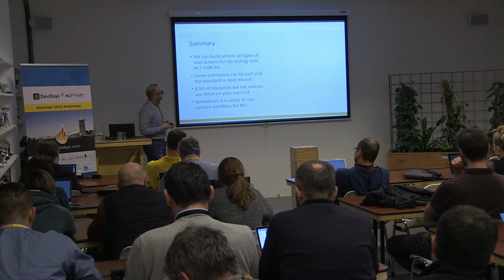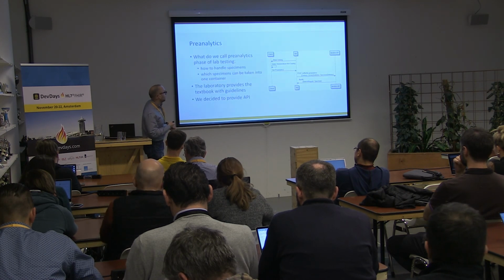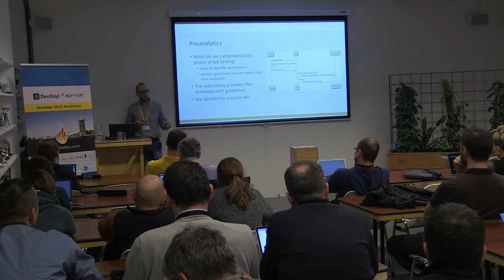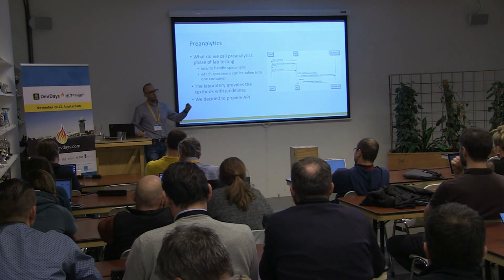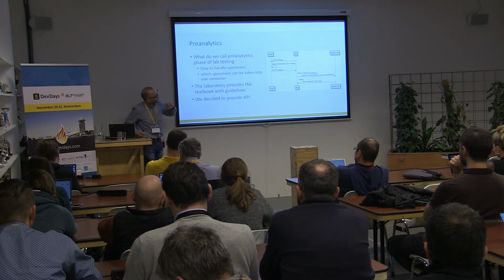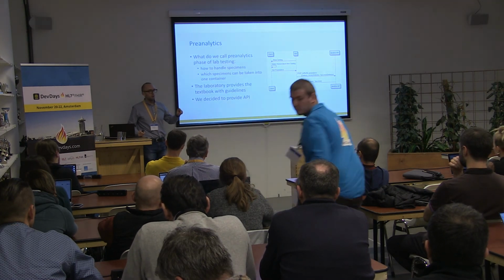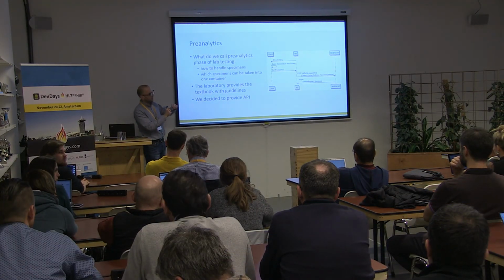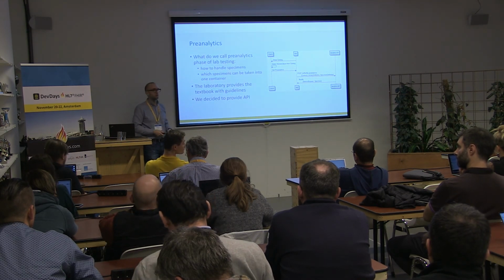And some of our customers can use the pre-analytics method. And if we know that they have some type of printer which we support, we can generate a base64 encoded version of the label, and they can print it on their own printer and put this label on the container inside the organization.